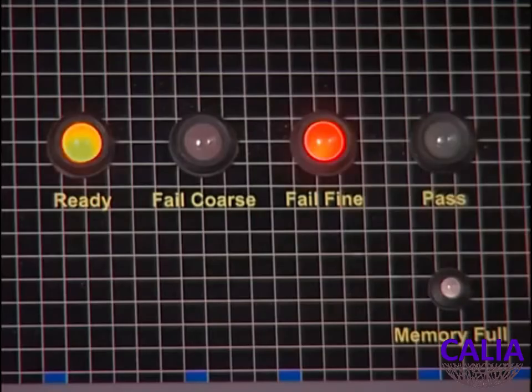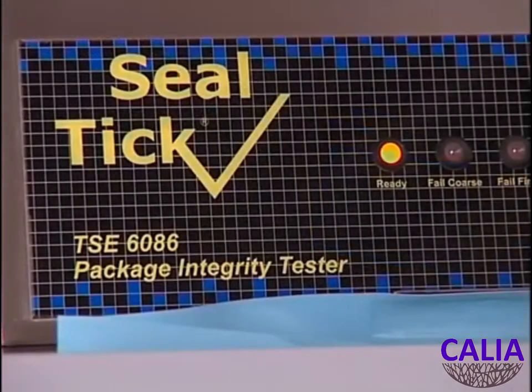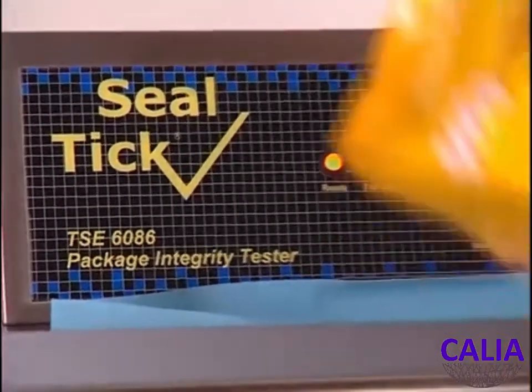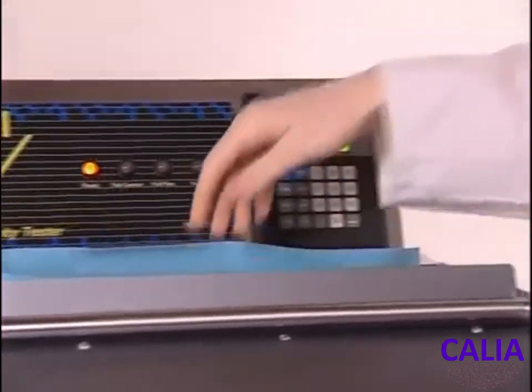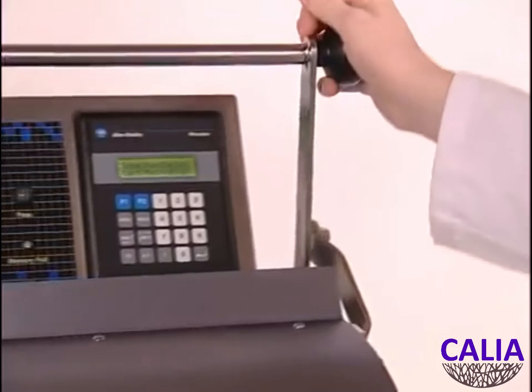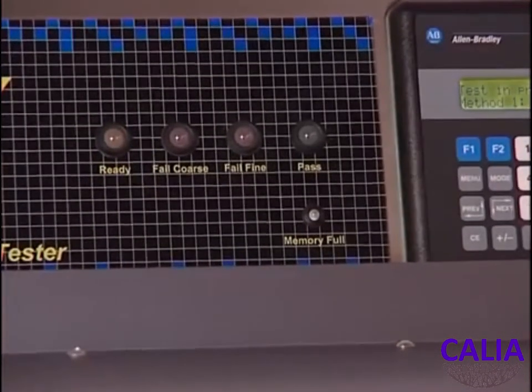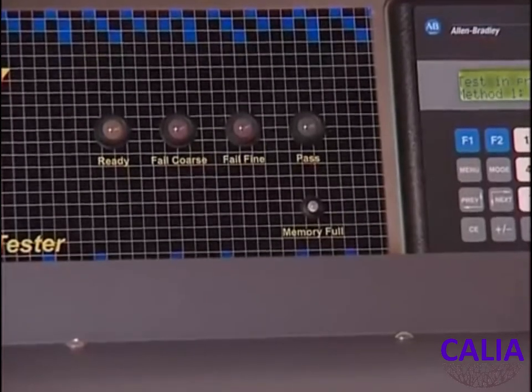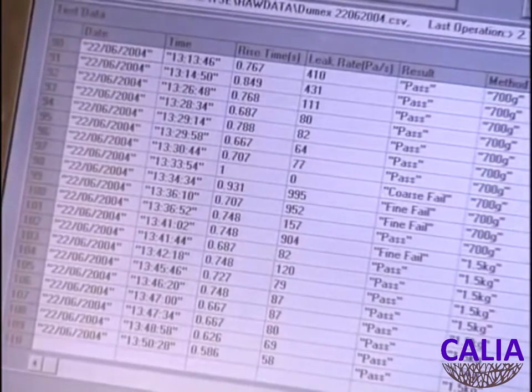A quantitative result is written to the internal log for later retrieval with a laptop computer as part of the quality traceability. The TSE 6086 avoids the complications of placing packs into a water bath and the issues of potential contamination that might arise from an uncontrolled source. It measures any leakage quantitatively, removing the operator subjectivity, and generates an electronic record of tests performed.